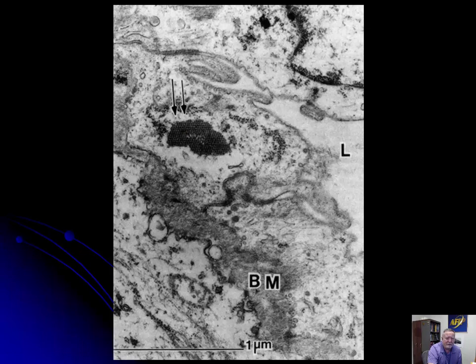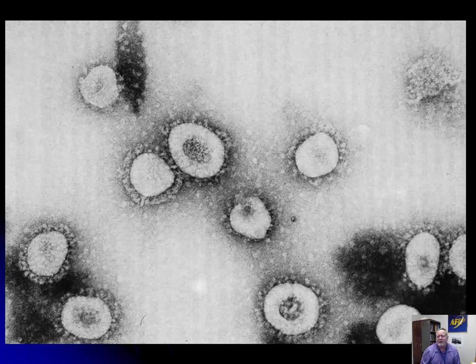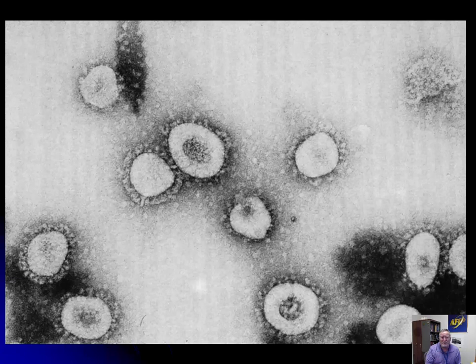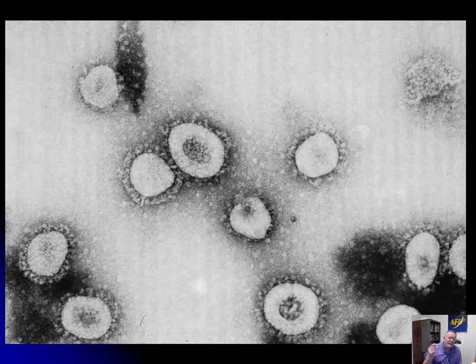Here's a negative stain of coronavirus from the feces of a ferret. Everyone is very excited about coronaviruses right now, and we should be — they are some of the most infectious viruses. My experience working with this particular agent was that it was extremely infectious. Even with rigorous controls in the laboratory animal rooms, we had accidental infections. I had one technician who accidentally walked from a dirty room into a clean room, and within two days every animal in that room was infected.